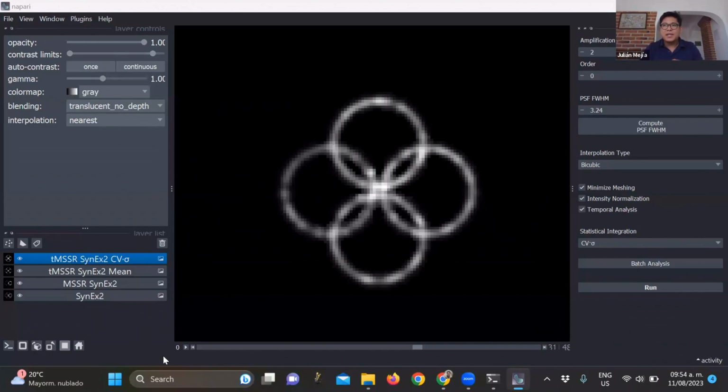That is a quite big and difficult question, because, for instance, in artificial intelligence, you have your ground truth data, and then you just can benchmark with it. But in principle, you have to do super resolution, because there is no other way to attain these kind of structures. The most basic approach that I'm commenting here is to ask your expert. As I comment, for instance, in the mitochondria, you show this image to the mitochondria expert and ask, do these structures make sense to you or not?